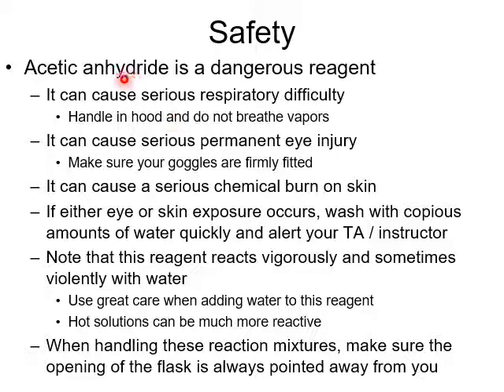So again, acetic anhydride is a dangerous reagent. It can cause serious respiratory difficulty. With a lot of compounds, you will always handle in the fume hood, and you should not get your face near these compounds. So do not breathe the vapors. It can cause serious permanent eye injury. You have to have your goggles at all times. It can cause serious chemical burn on skin. And if that happens, you wash with a lot of water and you alert me.